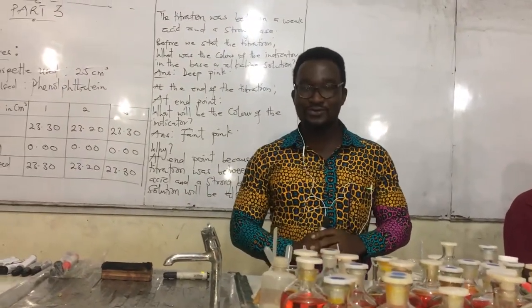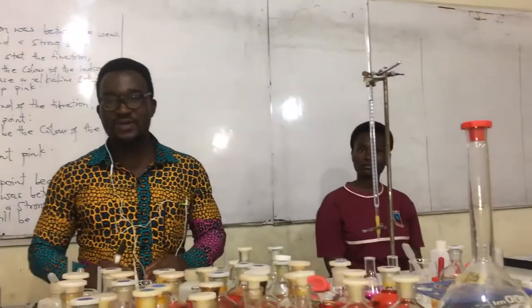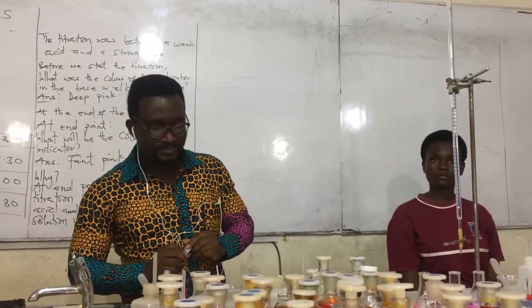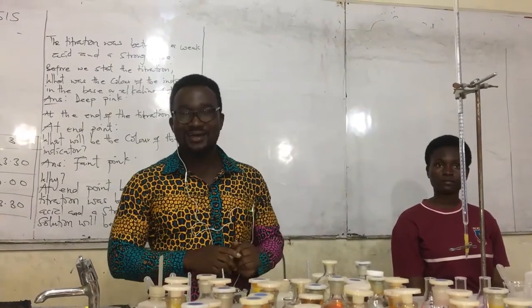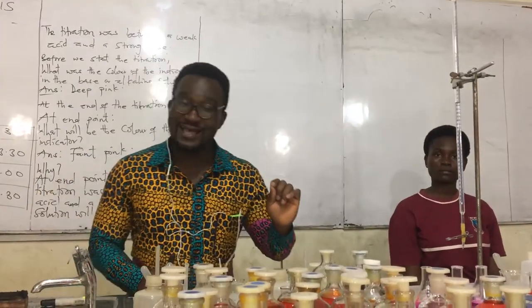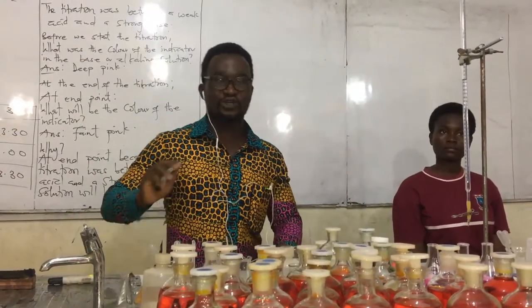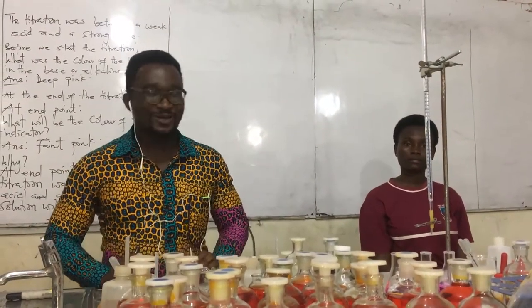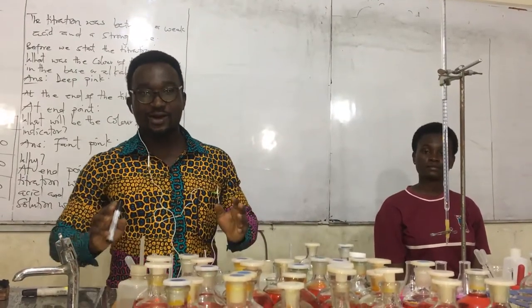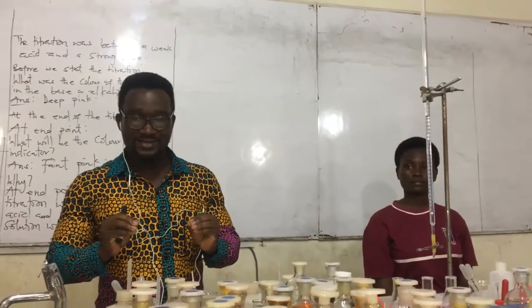Today, we have been able to go through a simple titration where we titrated a weak acid against a strong base. And we have been able to finalize our colors, our answers, and the rest. We are going to also capture another form of titration where we are going to use a strong acid and a strong base. Quickly, our madam will help us. In fact, she has done a very good job looking at what she did. It is not easy. That is why a lot of people pass the endpoint to get a colorless solution. It is not easy because you are supposed to be very keen.